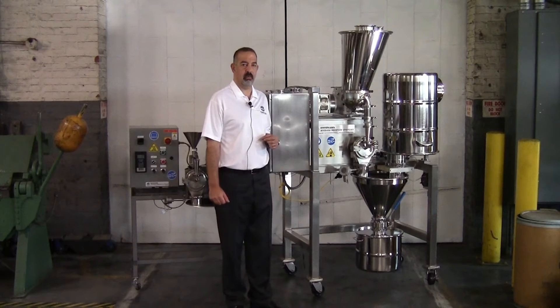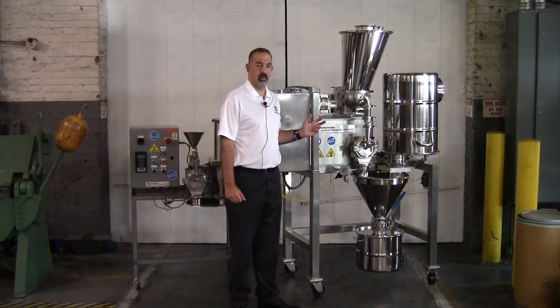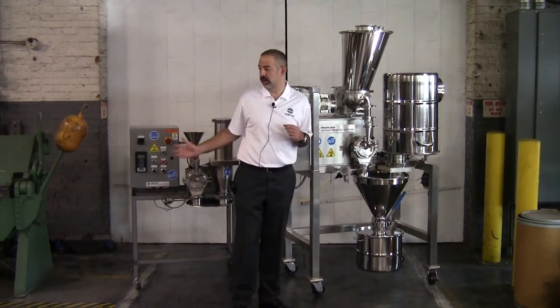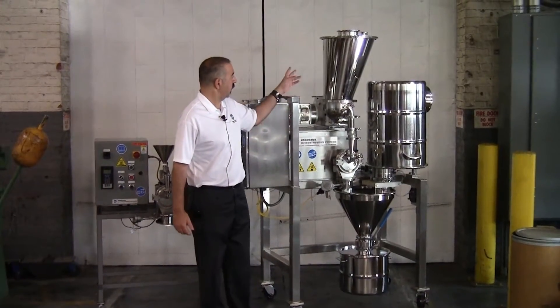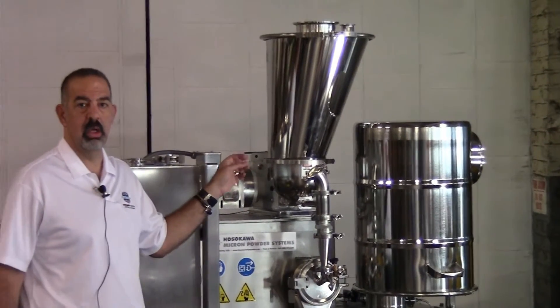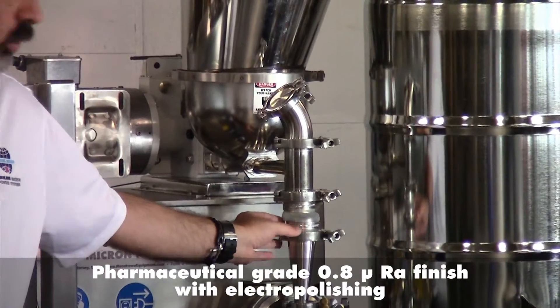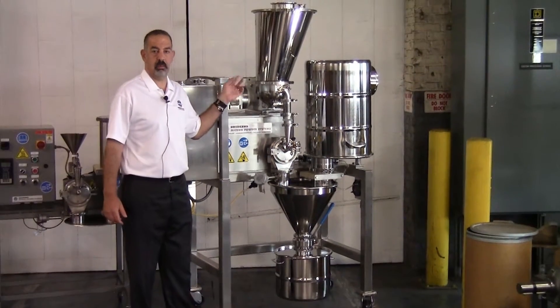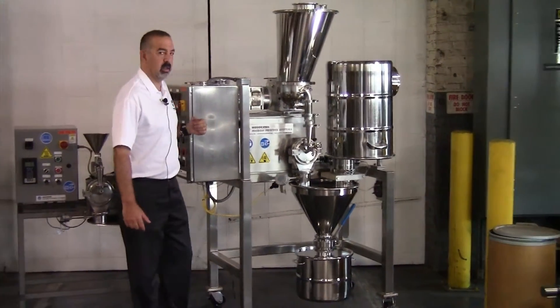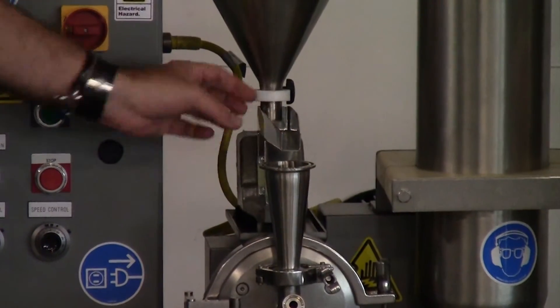Here I'd like to point out some of the special features we've included in the new unit on my left, and I will then point out the differences when comparing it to the standard unit on my right. We'll start with the feeding setup. You can see that this unit has a twin screw volumetric feeder on it, going through a closed coupled connection to the mill itself. This was to be able to control the feed rate much more accurately than what's available on the standard unit, which comes with an open trough vibratory feeder and an open feed.